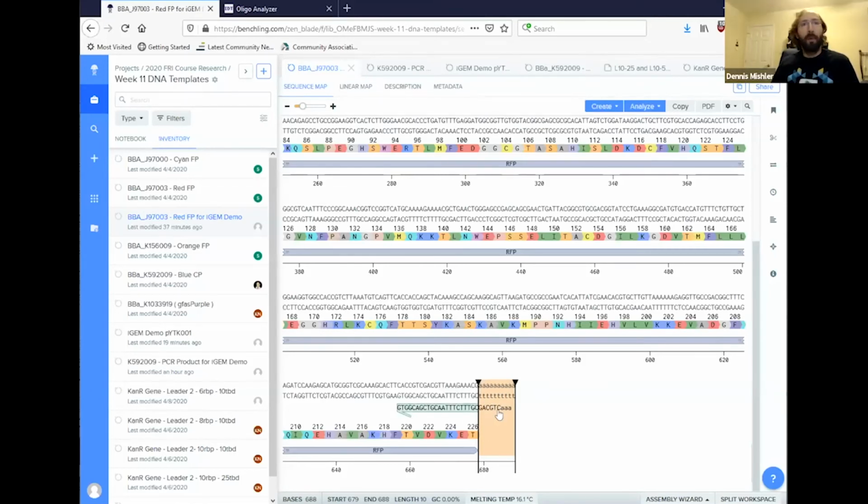In terms of the primer, these 3 A's on the primer can be pretty much anything. It's randomized to protect the restriction enzyme site here. To allow the restriction enzyme to work better, you usually want to have a few extra nucleotides on the end of the DNA sequence. So that's why I have those A's there. Some people have preferred sequences for this, but often it doesn't matter too much what it is.